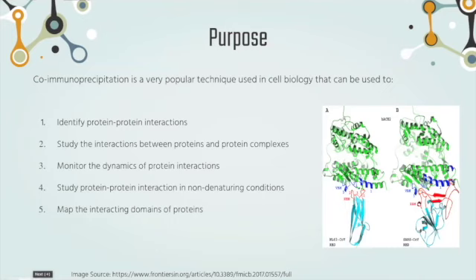of the target protein. I think it is also very important to note that co-immunoprecipitation can be used for identifying physiologically relevant protein-protein complexes. Because this technique can use lysed cells and non-denaturing conditions, it can give a glimpse of the actual protein-protein interactions that are happening in vivo, or in the cells.